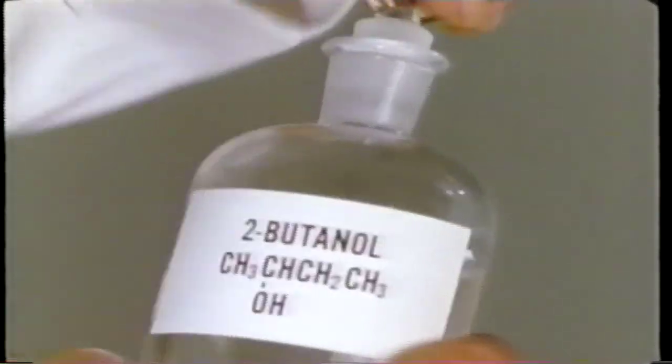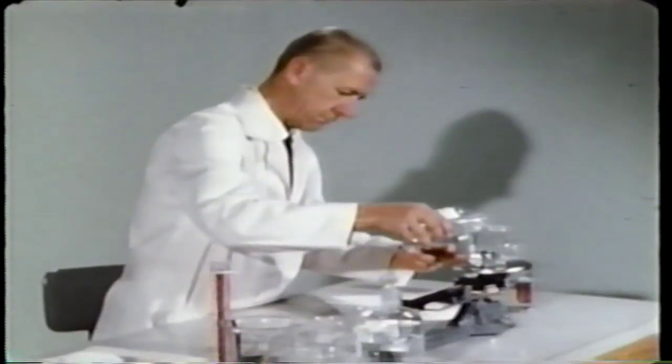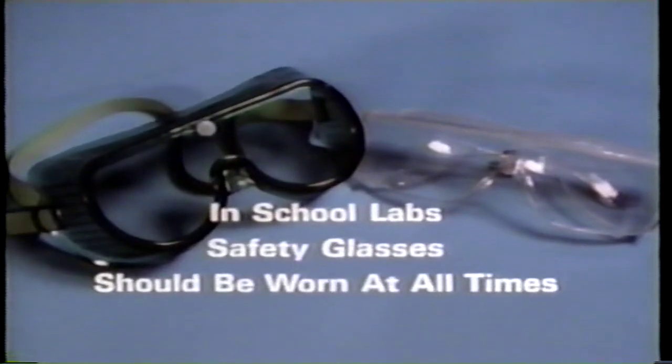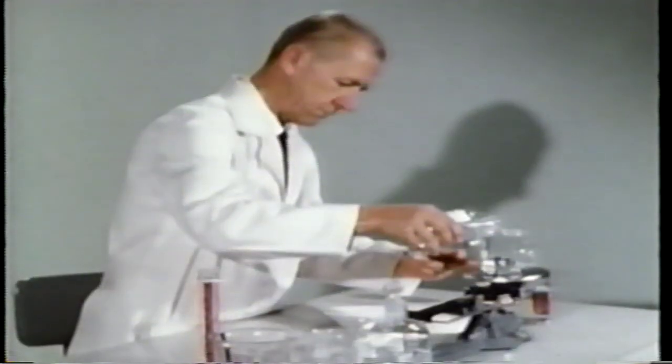Professional chemists use many safety precautions. However, in our process, equipment and chemicals are of such little hazard compared to the skill of the professional that glasses are not worn. In school labs, where someone else's mistakes can be dangerous to you, glasses should be worn at all times. Do note the great care and careful techniques Professor Geisman uses.